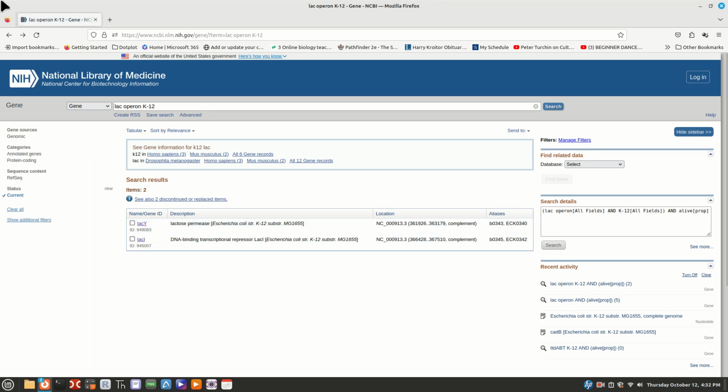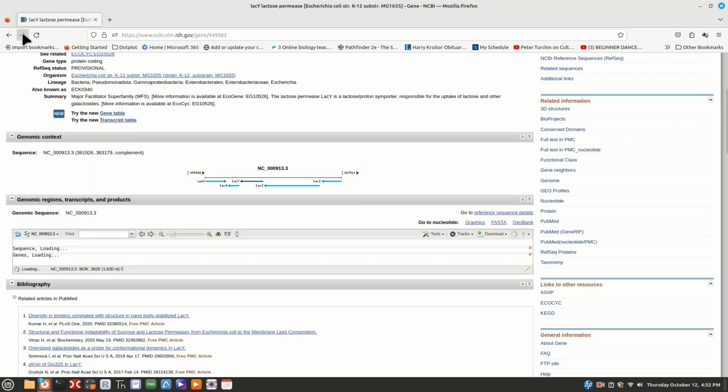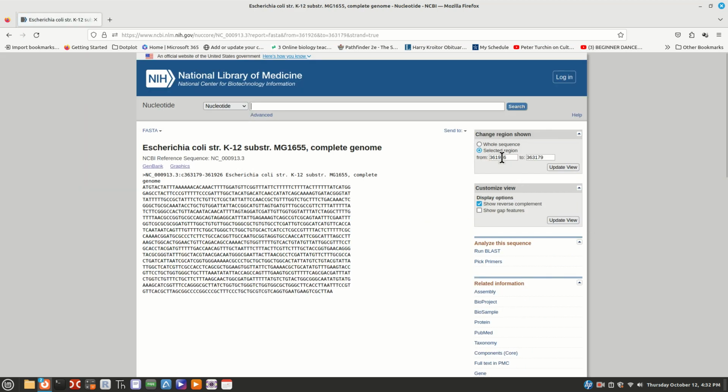Alright, so how do we do that? Oops, clicked the wrong direction here. Let's go back to our sequence. Well, we can come over here. And what I'm going to do is grab this sequence and change these numbers here. 361,900. Well, this is actually the smaller one. Okay, 361,363. And I want to go backwards to get the area before it. So instead, I'm going to take 200 off. So 361, and I'm going to change that 9 to a 7. All right, we're going to put that there.